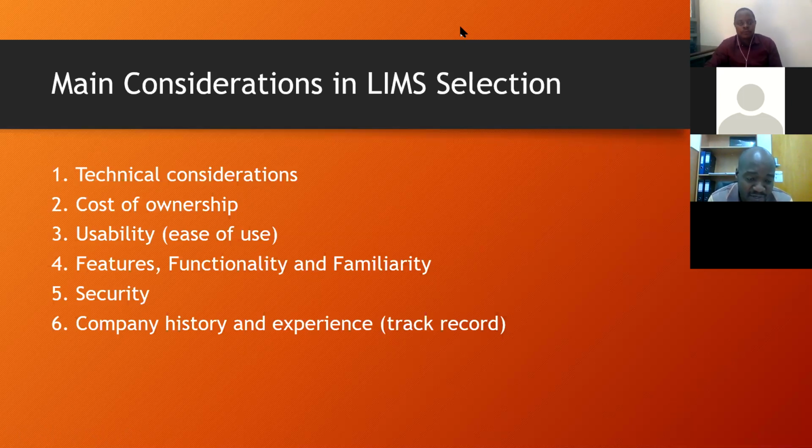And then if you're going to get a company or an organization to do it for you, you need to know their history, their experience in terms of provision of LISs, and also the support after implementation. So these are what I saw as the critical considerations for an LIS selection. Next slide, please.